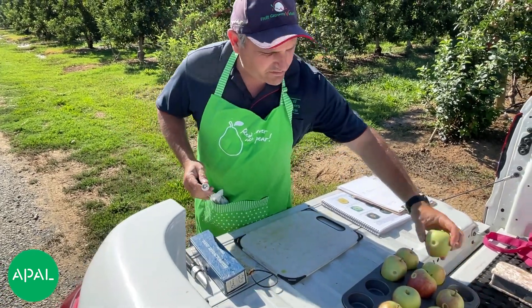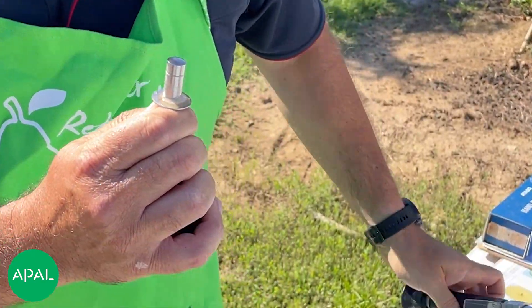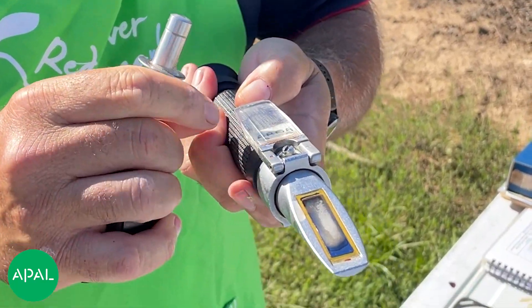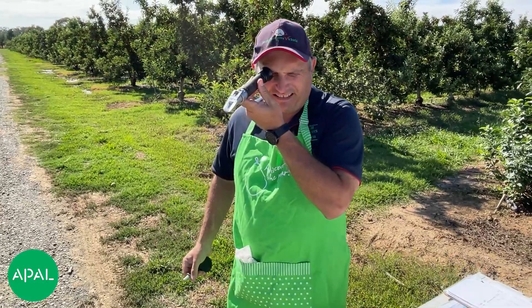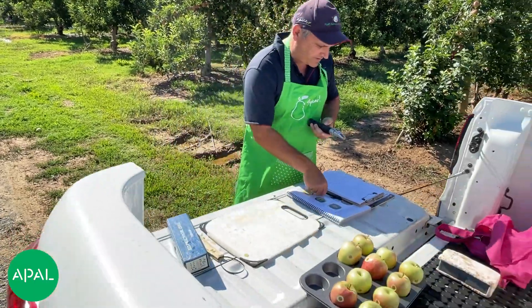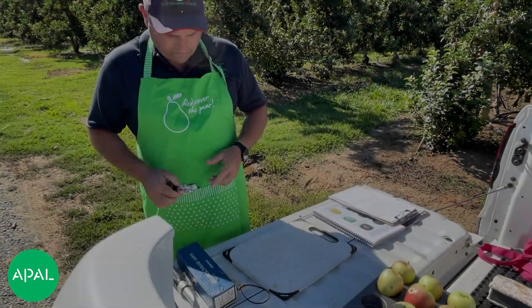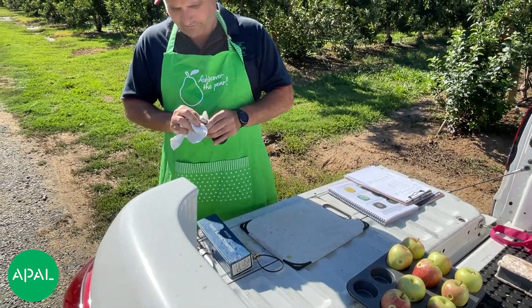Now we're going to look at sugars. I try to capture the juice on the refractometer from the apple and then get my reading. At the moment, it's still very early in the day — about 10 Brix on the first one. Between samples, wipe it down to make sure there's no sugar residue from the last test.